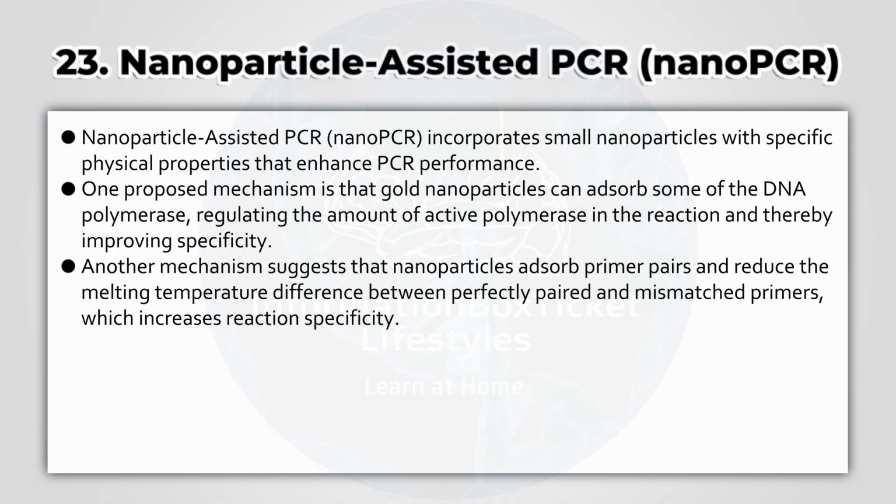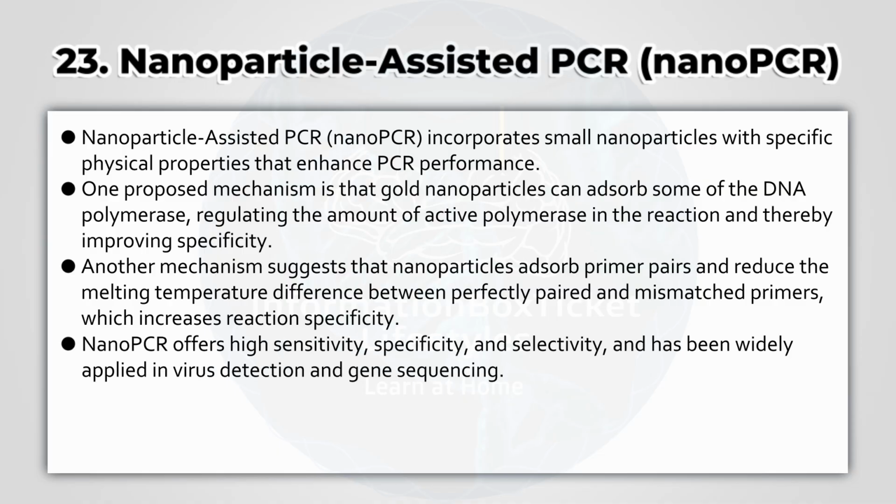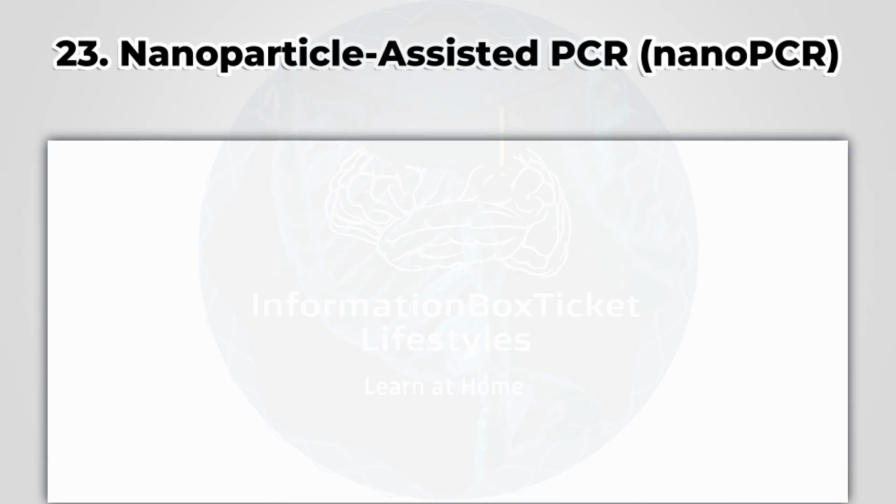Another mechanism suggests that nanoparticles adsorb primer pairs and reduce the melting temperature difference between perfectly paired and mismatched primers, which increases reaction specificity. NanoPCR offers high sensitivity, specificity, and selectivity, and has been widely applied in virus detection and gene sequencing.